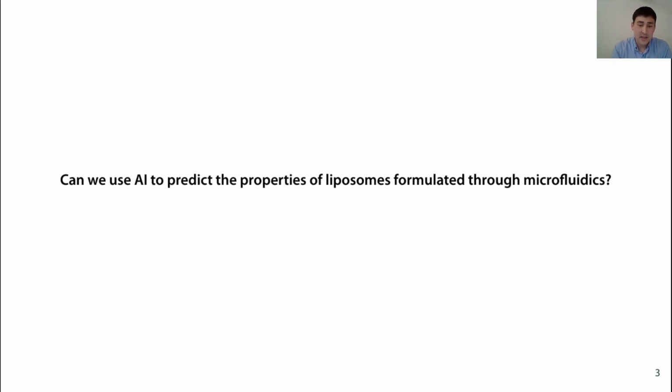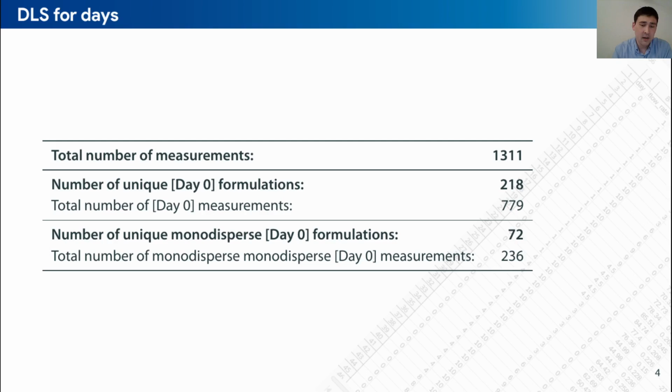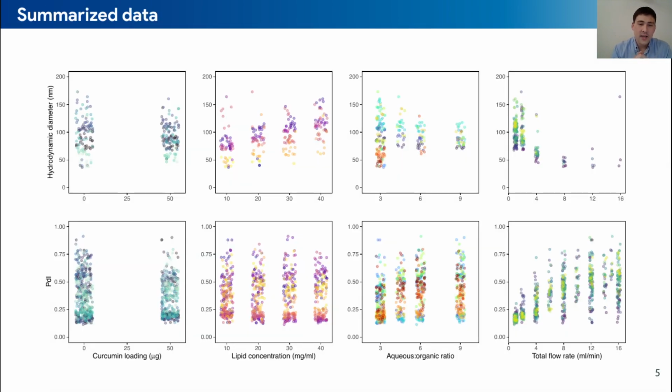of this synthesis process? So in this study, a quite large database of particles was synthesized, and the hydrodynamic diameter was measured via DLS right after synthesis, so this would be day zero, and then every 24 hours up to 3 days. And if you try to understand how the different microfluidic parameters affect liposomes, it can be very confusing.